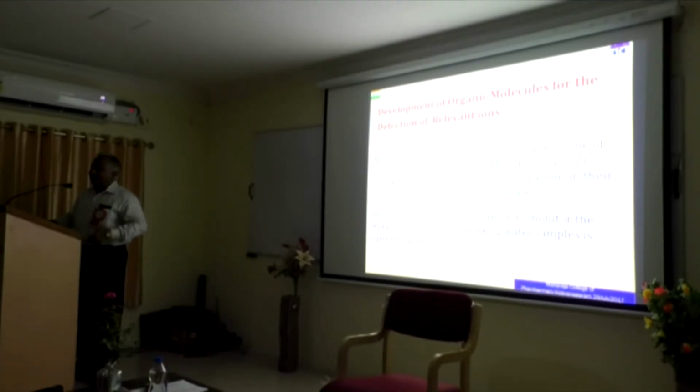We have seen that. So you require a method to analyze fluoride or chromium, all kinds of ions present in the water. For pharmacy people also it is very important. Whenever you use this kind of water, you must tell what the contents of the water are, and why you are using it. And if you are formulating something, syrups or a kind of viscous liquid, you have to tell that.